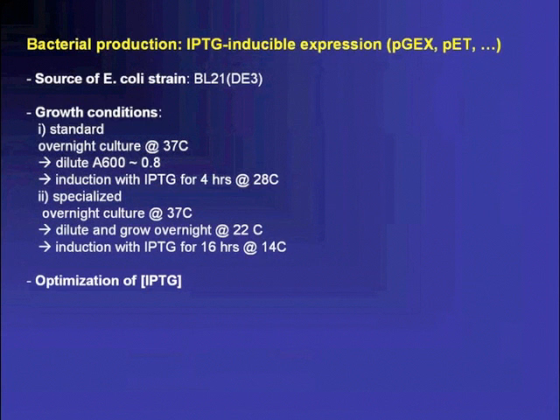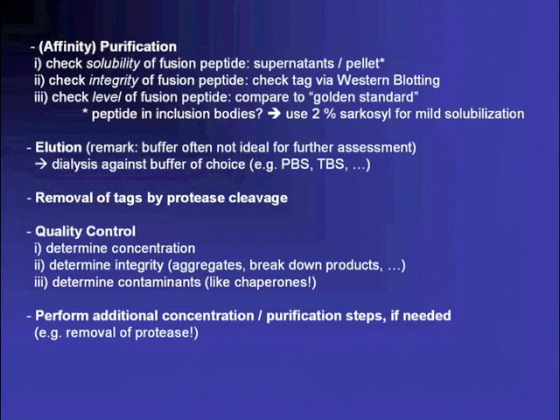Okay, so actually mentioning something on your slides, not necessarily related to the gene synthesis, you've mentioned sarcosyl a number of times for solubilization. I have not heard of this. What is it?